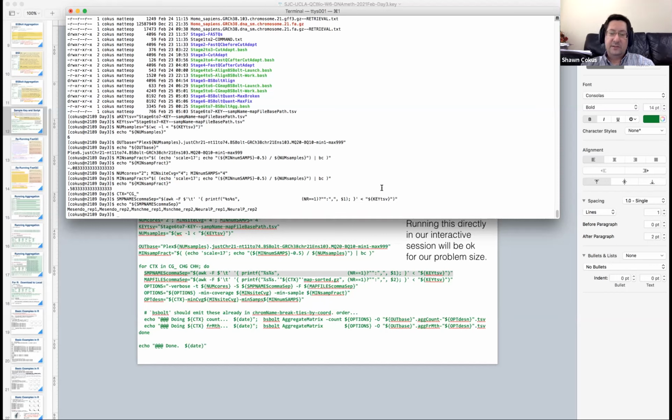I'm running awk as the command. Awk is getting its input from the key file. And awk runs this little awk script. Hopefully you talked about awk scripts in your intro to Unix thing or something. But awk is another little mini scripting language, and it's just convenient when the program is so simple that it fits in like a command line argument as it does here. And there's even shorter ways to write this in awk, but this is sort of the style I like.